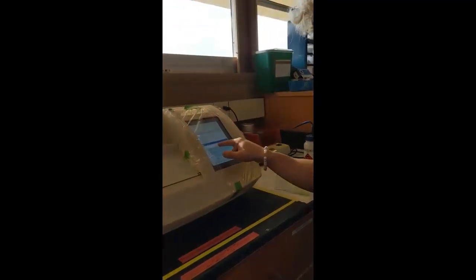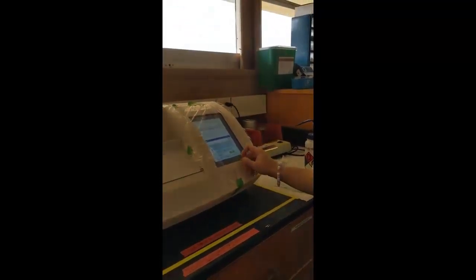Yes. And then we're going to tell it 15 grams. Because I said it was 15 grams in 100, it already says out of 100. So I'm just going to put 15. There you go. And just hit enter.